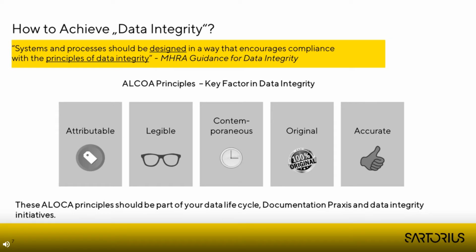The data must also be original. Original data means in this context the first capture of the result or the information, and this data must be signed, reviewed, and readable over the entire retention period, which can be in a GXP environment 20 to 30 years. Therefore, you should use standardized data formats instead of vendor-specific whenever it's possible, where the data can also be read in future, maybe after a change of an operating system.